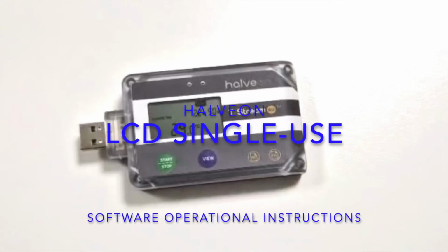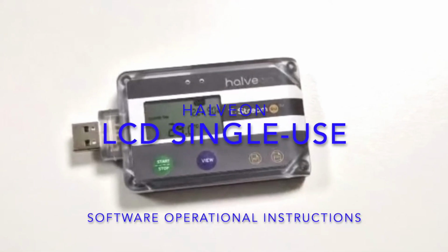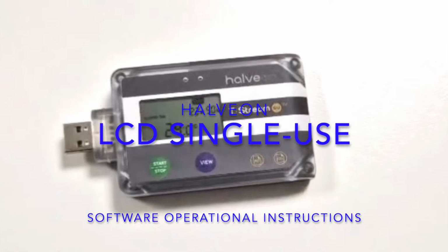This is the Halveon LCD Single-Use Data Logger Software Operational Instructions tutorial.